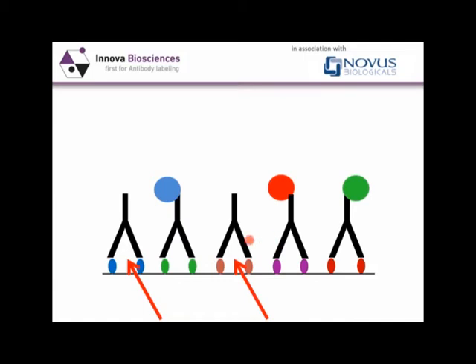The slide I've put up here is really to highlight, however, one of the problems that comes up with the ability to undertake multicolor flow cytometry, and that is in relation to the availability of reagents, particularly directly conjugated antibodies. In this particular example, we're looking at a diagrammatic cell with 5 different antigens on the surface that people want to stain. They have antibodies available to each of those, but only 3 of them are available directly conjugated in commercial forms. 2 of them are only available in an unconjugated format, and that gives them a real problem in determining how they're going to undertake a multicolor experiment.